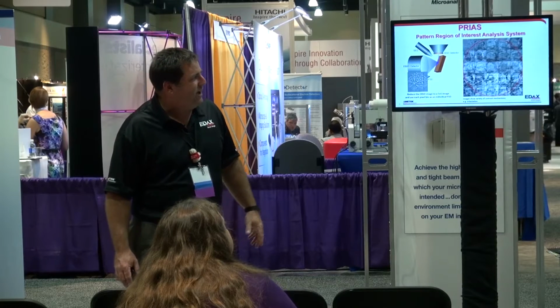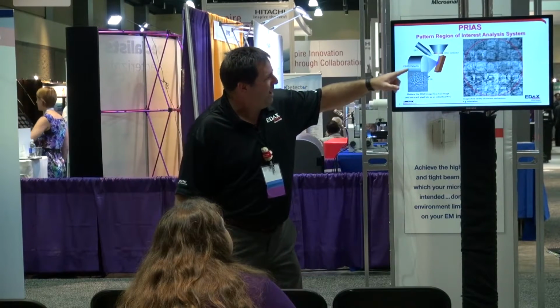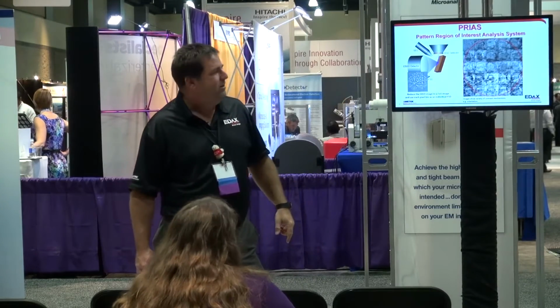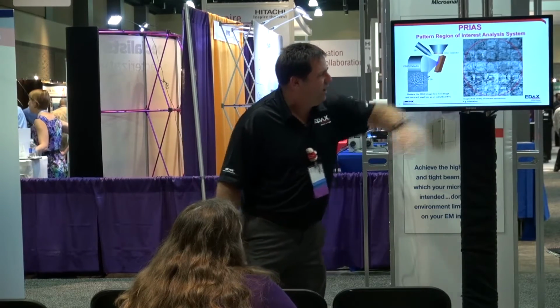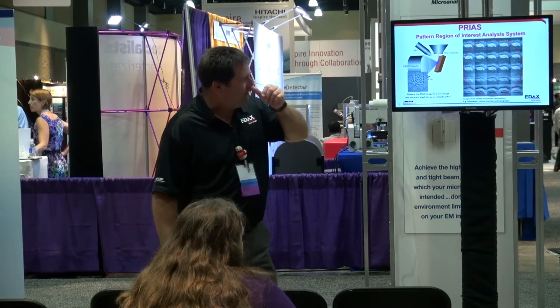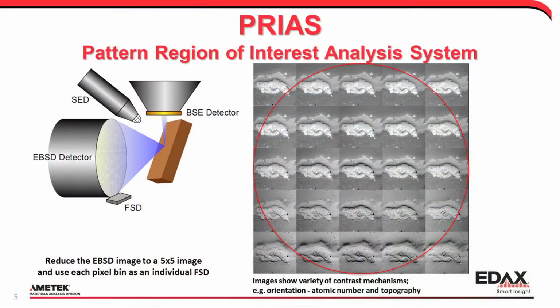And so there's a couple of interesting things to point out. If you look at this top left signal, in this case you don't see much change at all. And in all these, we're only clipping these a little bit. You can see in here how we get really strong contrast and it kind of changes modes. Depending on the type of sample, this is now a multi-phase sample, there are times we get really strong signal contrast, even from those small little clips of the phosphor screen.